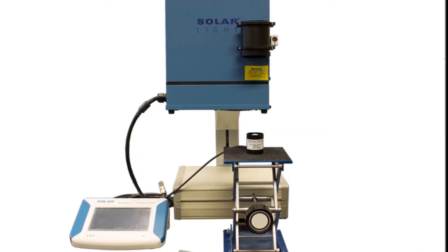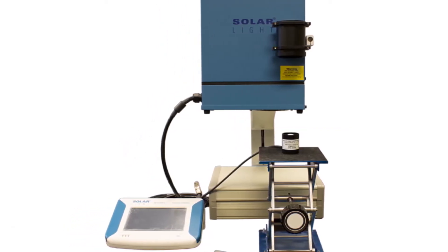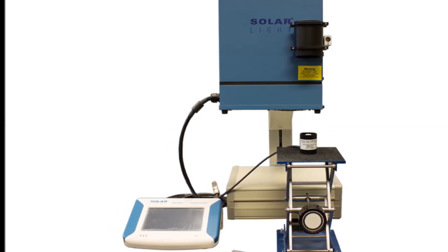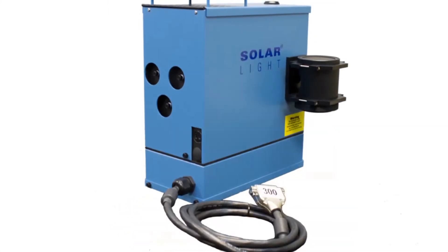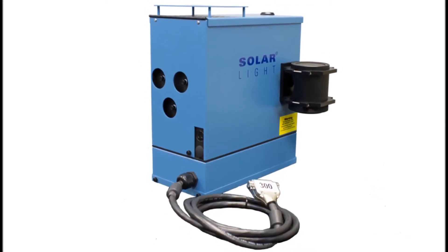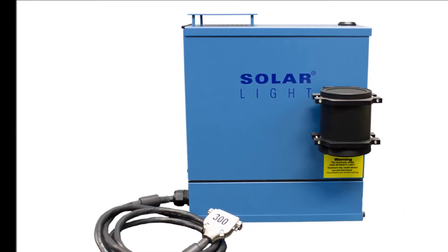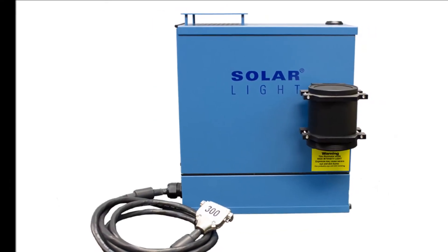Solar Light simulators in the 16S-series are high-precision turnkey testing light sources for professional and laboratory applications. The 16S-300-009 is a complete light source package for pre-irradiating the PMMA plates used in broad-spectrum in vitro testing of sunscreens, as defined by ISO and the FDA.